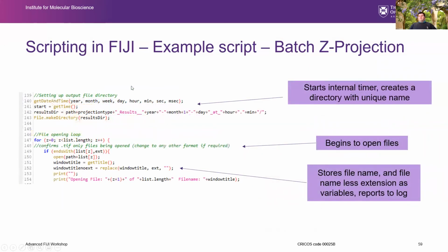Okay, now we're getting into, once everything's set up, we want to get the internal time and the date and time for now when we're going to run, because we get the date and time at the beginning, but maybe you spent 10 minutes or you got distracted. So the actual script runtime begins here, because now there's no more any user input.